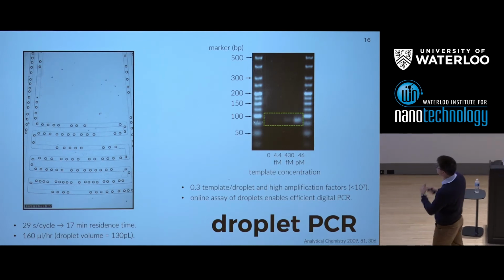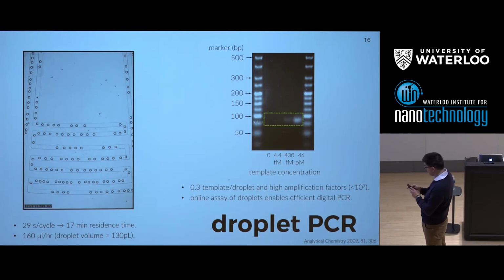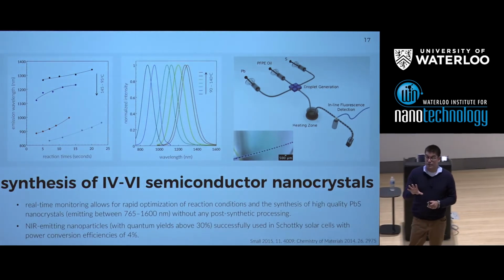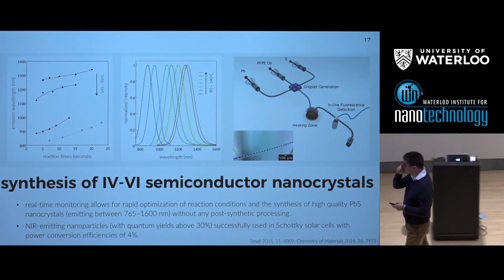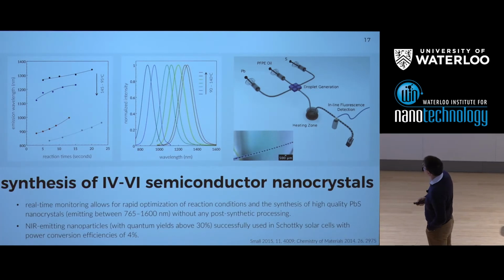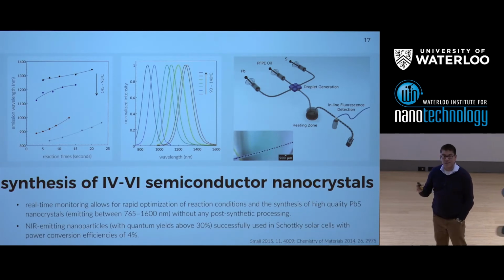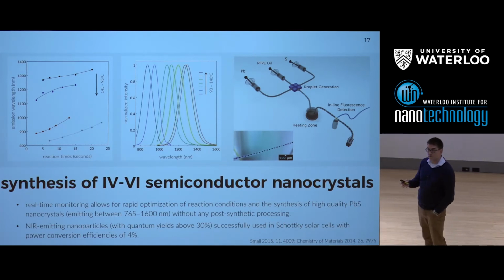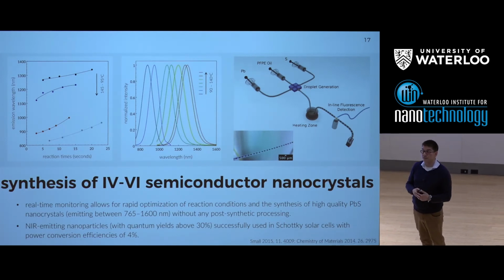So this is clearly very important and has since, and before it, in fact, been used by people like Rain Dance to do some really beautiful experiments using droplets in a way I think that commercially hasn't been done before. So moving on very quickly, I wanted to go back again and tell you a little bit about nanomaterials. So I said that continuous flow systems were actually quite good for doing nanomaterial synthesis, but because the material interacted with the surface, that provided us with some limitations.